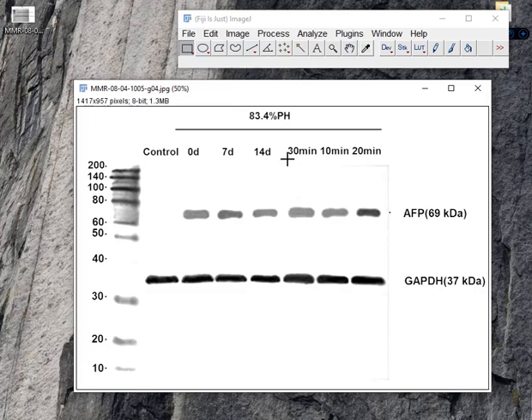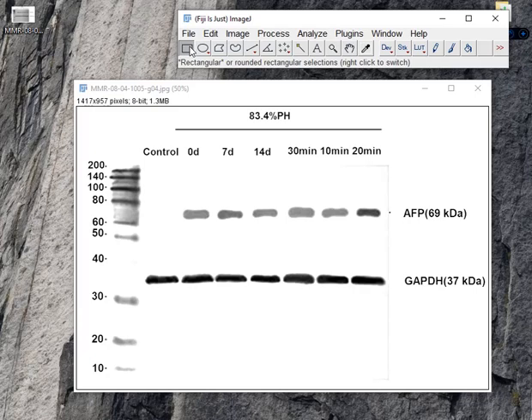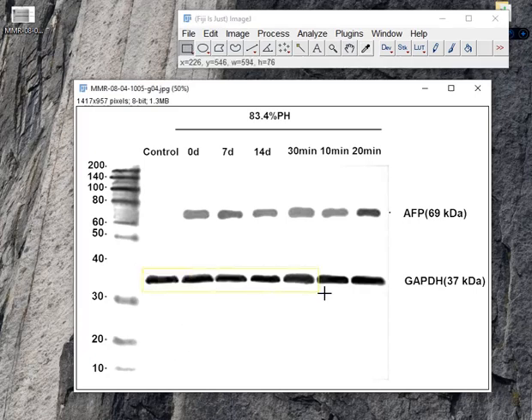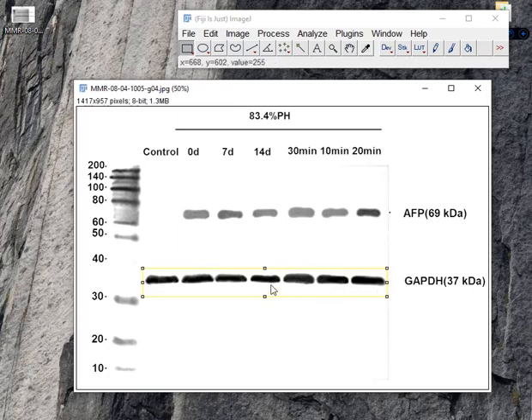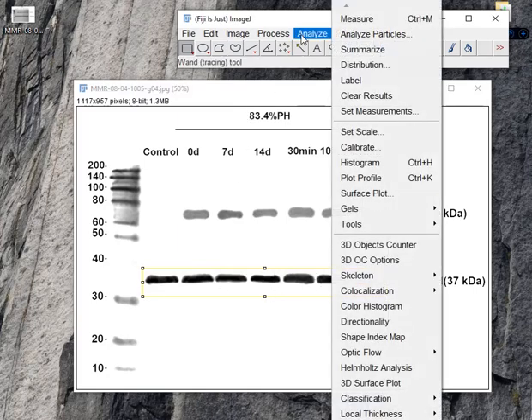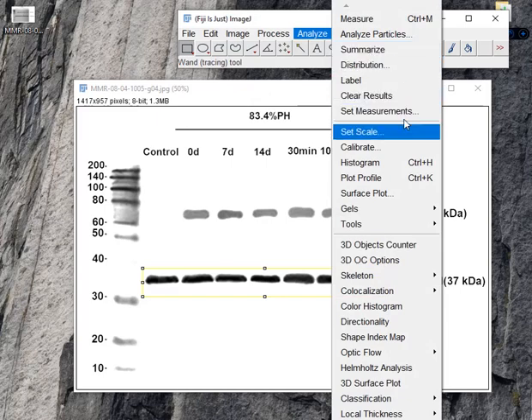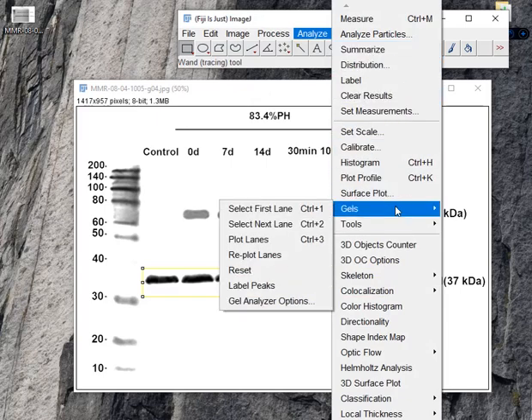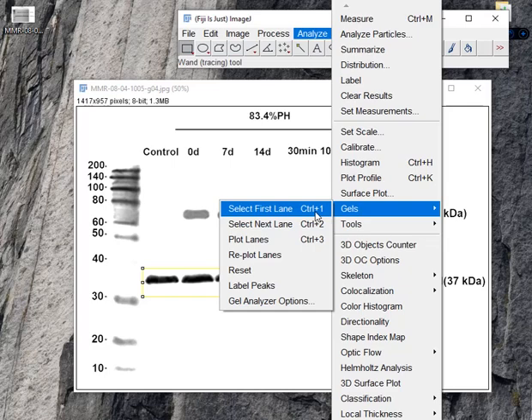The second thing you have to do is select the rectangular tool. I clicked it and selected the lower band. You can see I selected and clicked analyze gels. First you have to click to select first line.